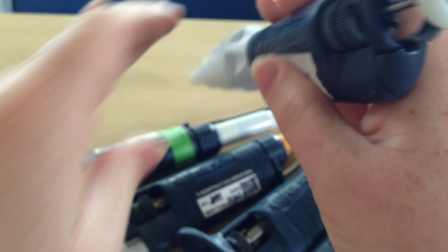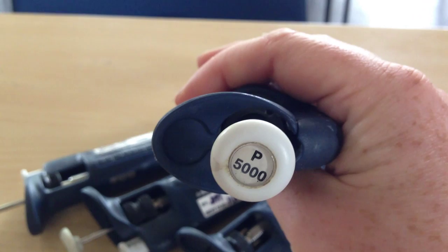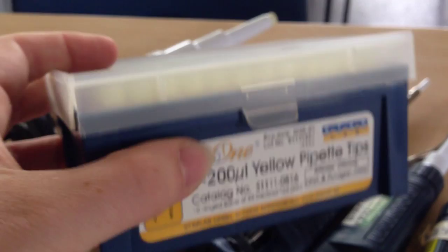And then we have a P5000. That's for 1 ml, 1,000 microliters, up to 5,000 microliters. So that's the first thing you need to know.